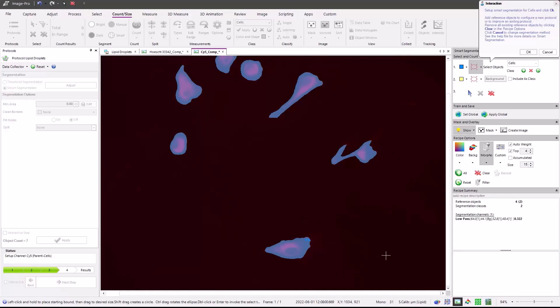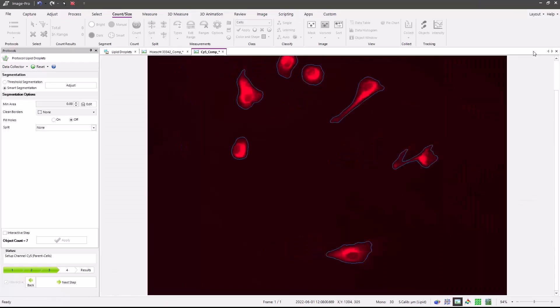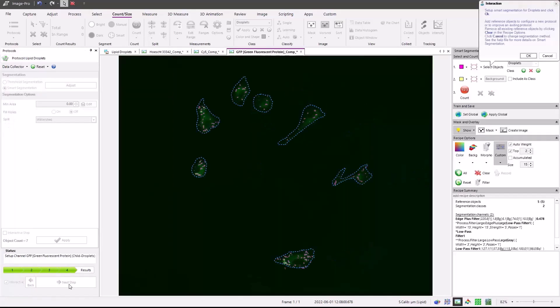As with smart segmentation machine learning, we can delete the reference objects and draw them again to find the cells and the background. Or if needed, we can always create a new recipe by hitting the reset button. Now that we've found the outline of the cells, press the OK button. Similar segmentation options are available in this step, the minimum area, clean borders, fill holes and object splitting. Here we just find the extents of the cell boundaries to measure the lipid droplets in. Press the next step button.